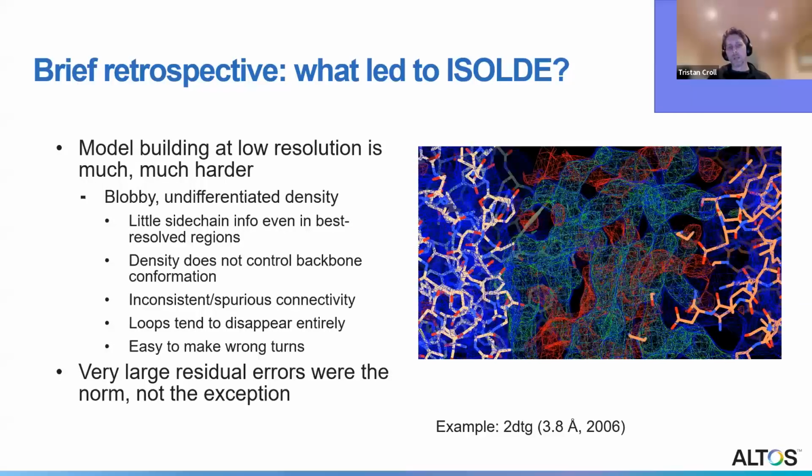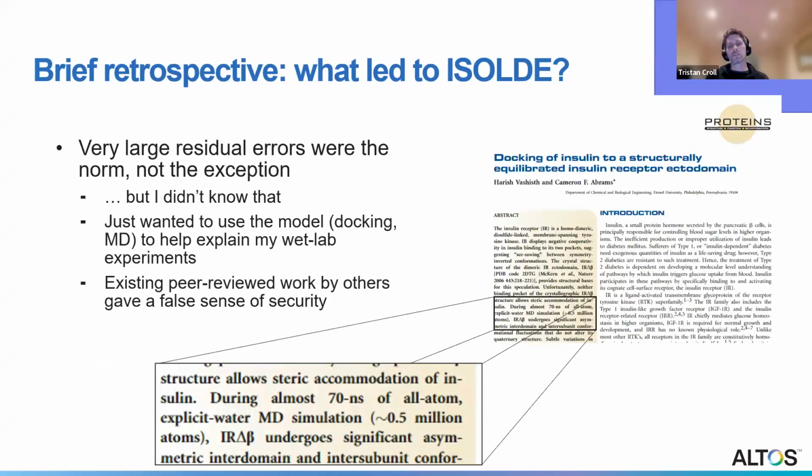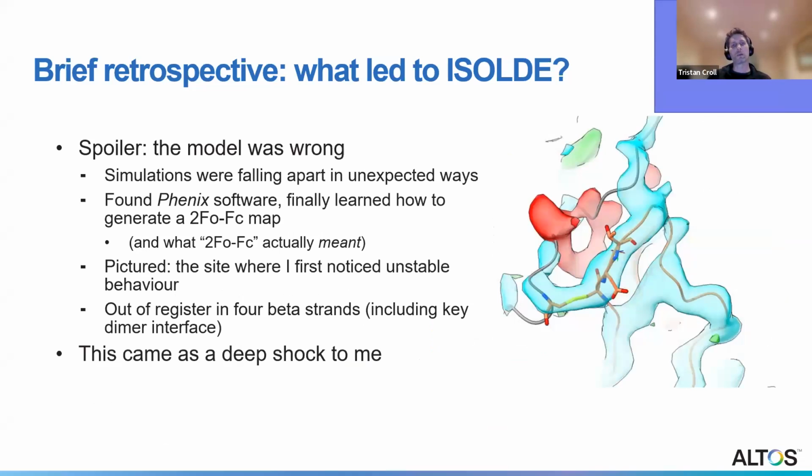And in my own defense, I thought I was just following more experienced people at the time, because there were already published papers that had done 70 nanoseconds of MD simulation of this, which at the time was an enormous amount and very, very expensive in CPU time. And I just wanted to use the model doing docking, doing MD to help explain the experiments I've been doing in the wet lab. Armed with a lot of naivety and the confident bravado of ignorance, I went along and did a bunch of simulations which fell apart horribly.